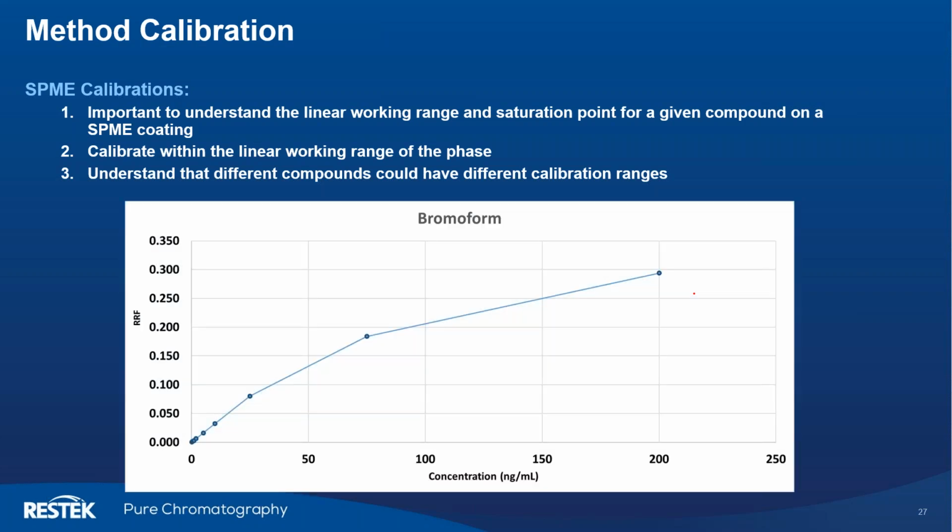So, when we were looking at bromoform, on the x-axis we have our analyte concentration, and on the y-axis we have our response factor. If we look at this extraction, we can see that we get this plateau starting to occur, and this is going to impact our linearity for our calibration. And this is the point at which we say we've reached analyte saturation.